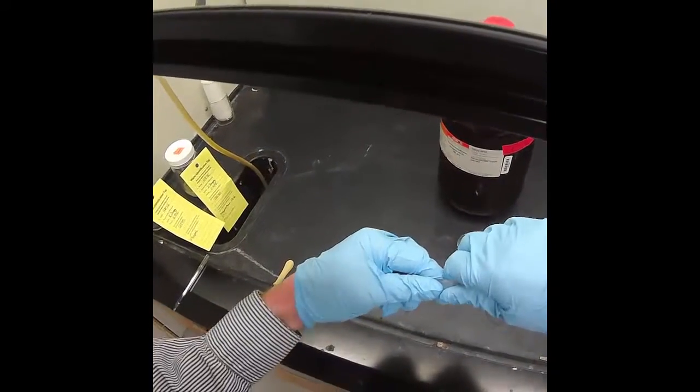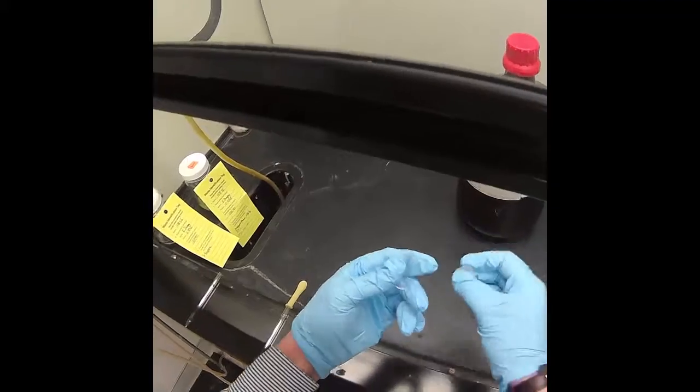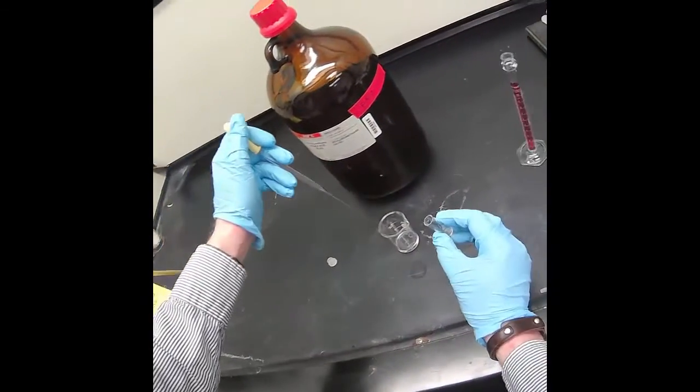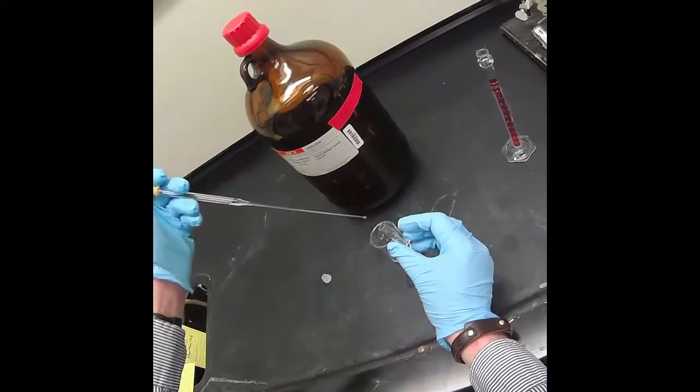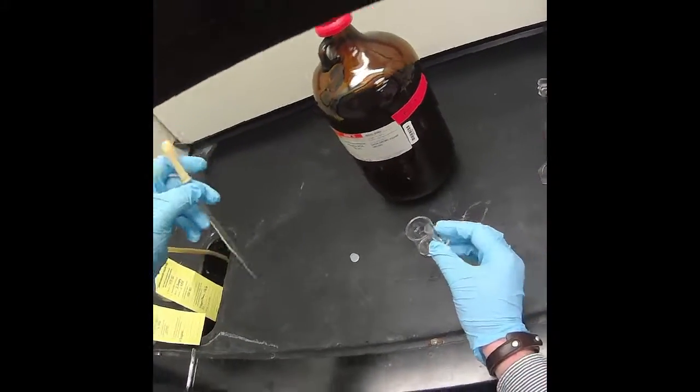So here I have some of my polymer solid. And I'll just add a little bit of dichloromethane so that it dissolves to make a homogeneous solution.